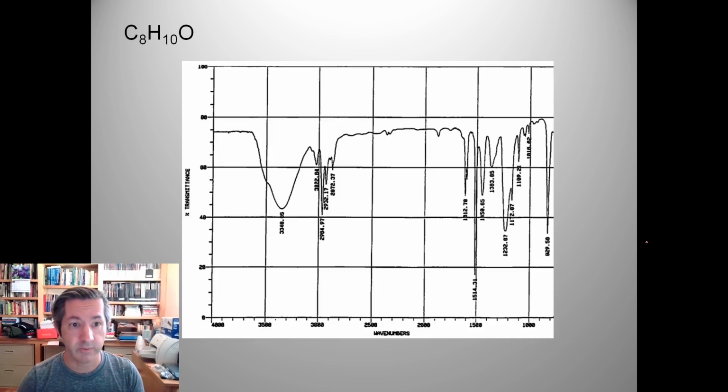And so we'll start off with this compound. This is C8H10O, and I'll show you how to tackle these problems. So again, you can go into this with a molecular formula, because that formula is obtained from the combination of a mass spectrum and an elemental analysis. So it gives us a little piece of information. Now what we can get from the IR, we are kind of limited. We go for the functional groups here, the types of bonds.